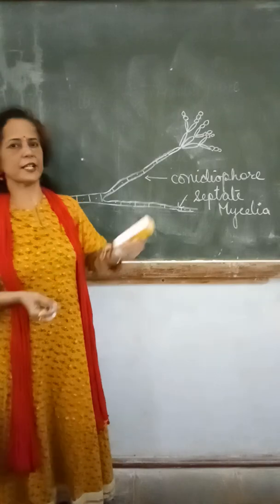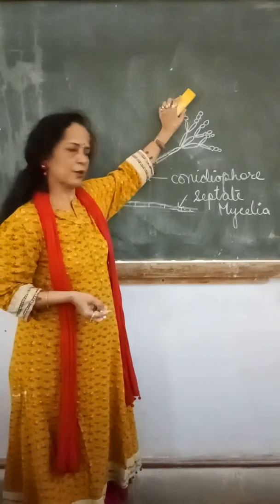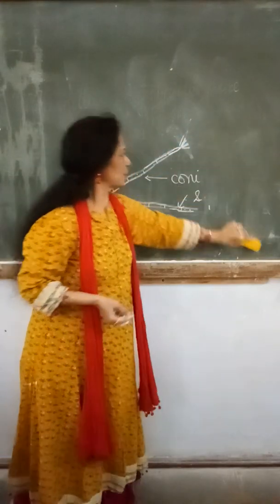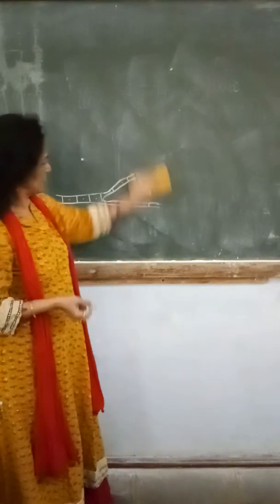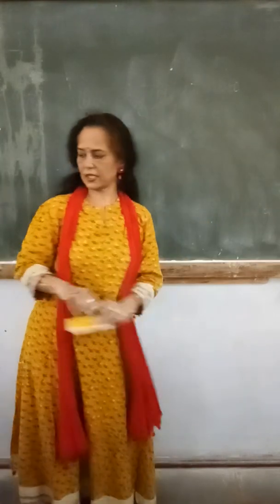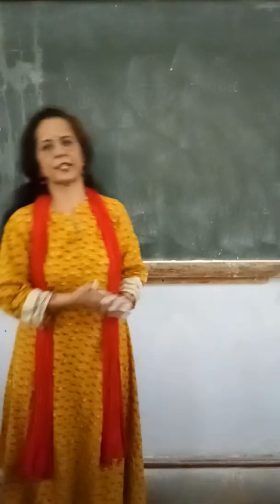This fungi is involved in production of antibiotic, and that is called Penicillium. So this is about the higher fungi. Now the rest of the fungal cultures we are also going to study.